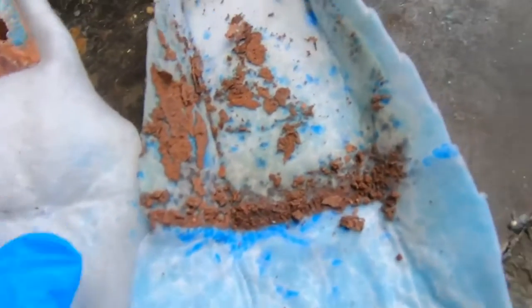Okay, now here is the e-waste anode. A lot dirtier of a material. You can see there is some brown staining there. I tried to remove as much of this stuff as possible. It's caked in there pretty good. There is no anode sludge per se, just some minute discoloration. You can see here it pretty much ate itself apart.